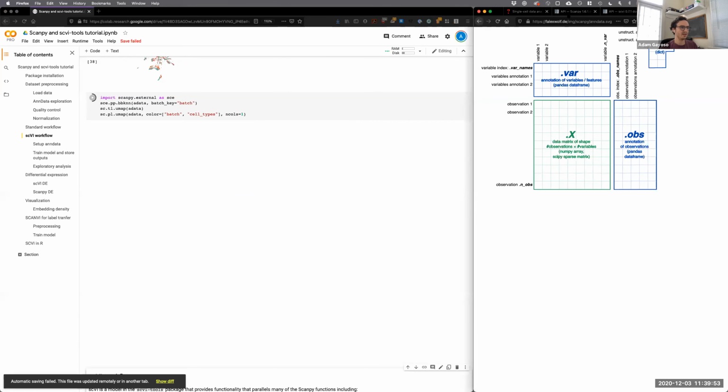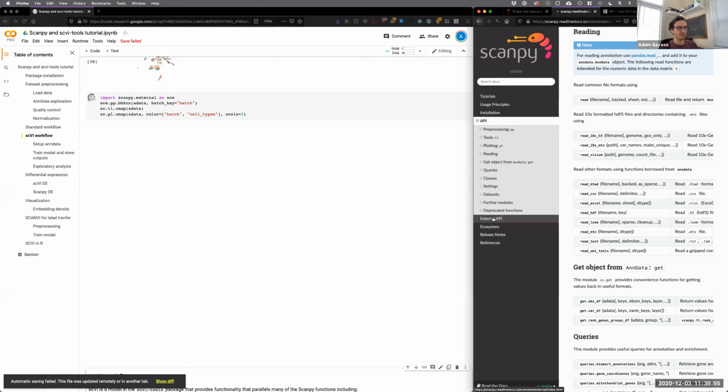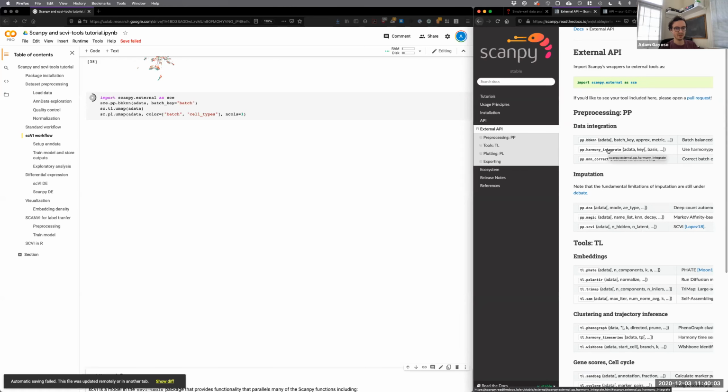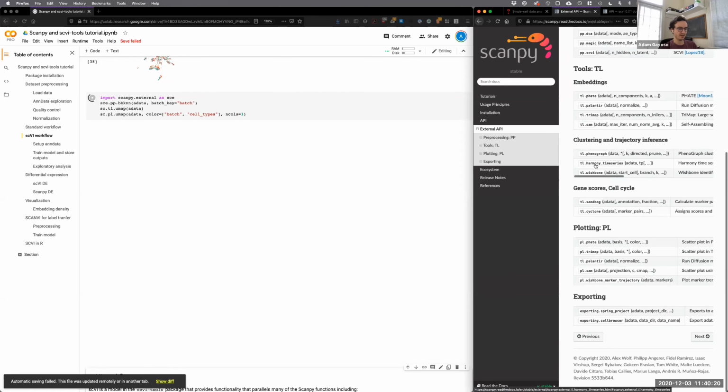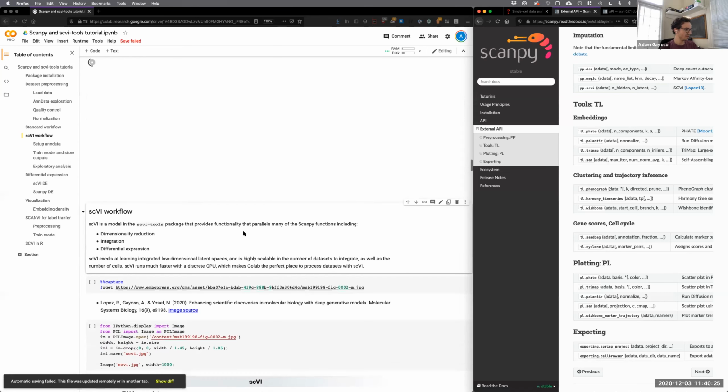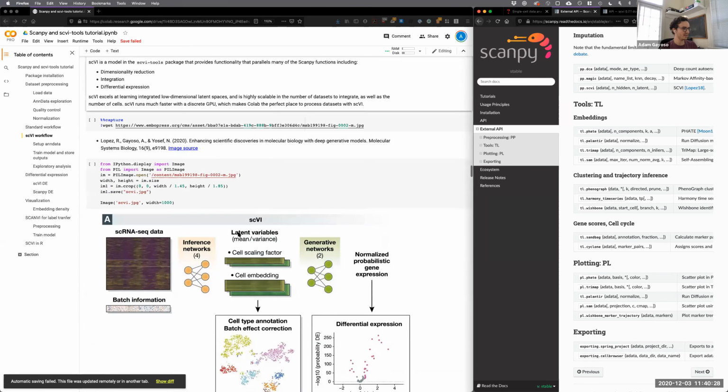And you can go through the Scanpy docs and sort of, they have this external API. So if you're someone who likes to develop methods, you can submit your method to Scanpy, and they host a number of these. So Harmony is another really good integration method that is popular in R, but there's a Python implementation here. Similarly with MNN, which is probably like the first modern single cell integration method. And there's just a number of methods here that are worth trying out. I already see that time's going by quickly. So while that goes, I'll start talking about scVI.